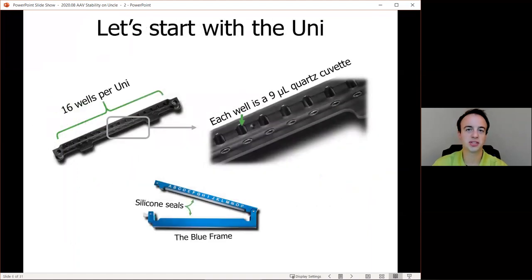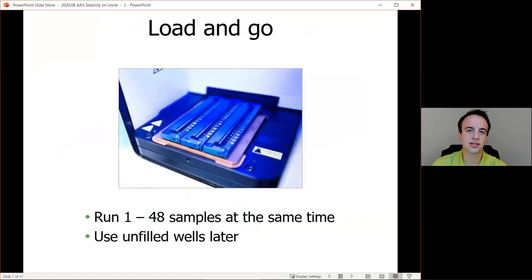So that brings us to the uni, which is what makes all this possible. And it helps make UNCLE truly unique because it provides high throughput and a small sample size. Each uni is 16 quartz microcuvettes that hold nine microliters of sample, and then they are enclosed within two silicone seals, making sure that the sample is sealed tight and is not prone to evaporation or leakage. It can actually be frozen and placed in the actual uni itself. But in this case, we actually close the uni around the sample, and then we load it onto the heating element of the UNCLE, where we can run from one to 48 samples at the same time, use whatever we don't want to load later.